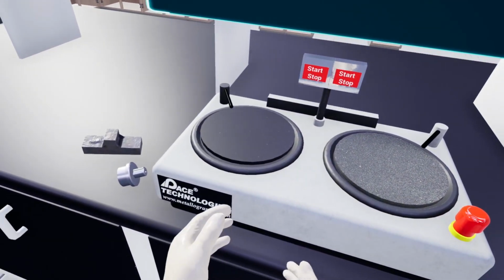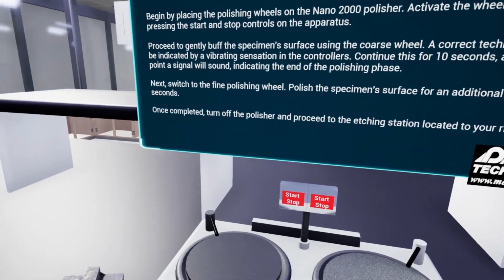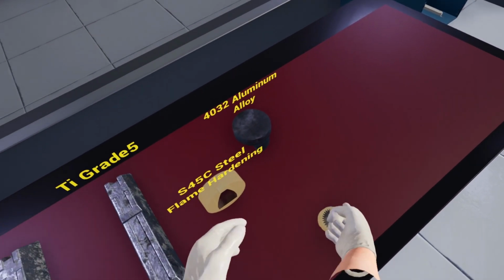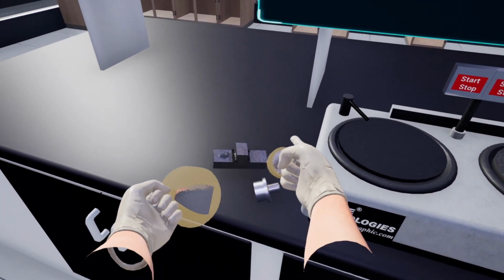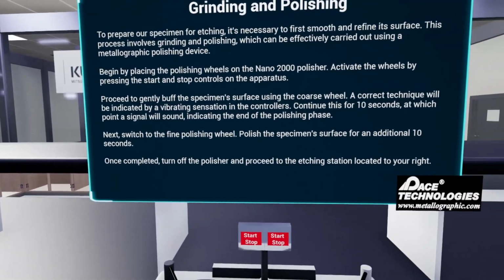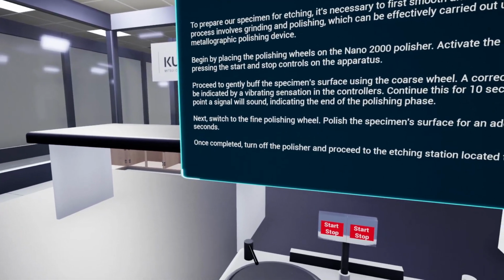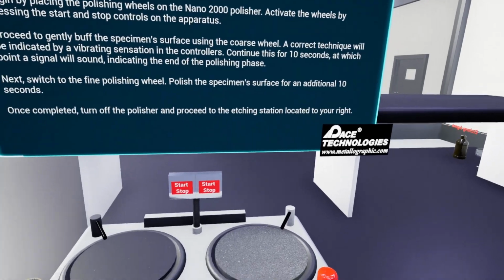Proceed to gently buff the specimen's surface using the coarse wheel. A correct technique will be indicated by a vibrating sensation in the controllers. Continue this for 10 seconds, at which point a signal will sound, indicating the end of the polishing phase. Next, switch to the fine polishing wheel. Polish the specimen's surface for an additional 10 seconds. Once completed, turn off the polisher and proceed to the etching station located to your right.